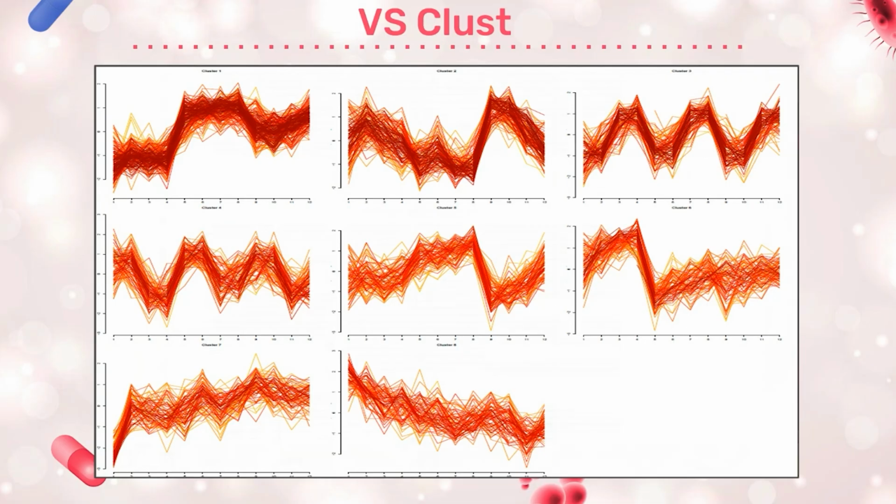So this is pretty useful because the idea is we can hopefully get a group of proteins that are all acting similarly when they contribute to this extent. And we're able to map out all the conditions. So this is basically separating all the proteins we got data on into 8 different groups and just showing how these proteins interact. And as you can tell, they all have a similar pattern.